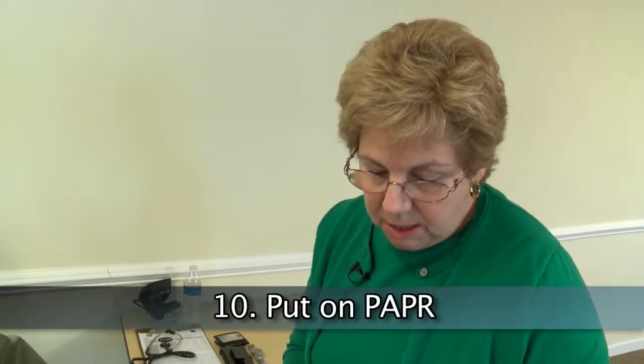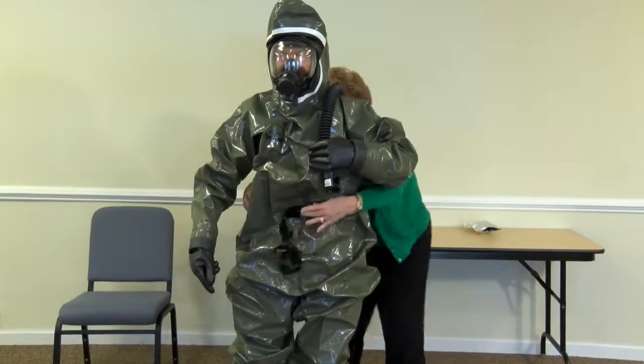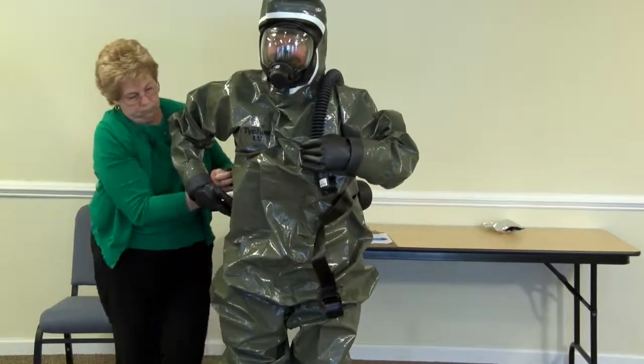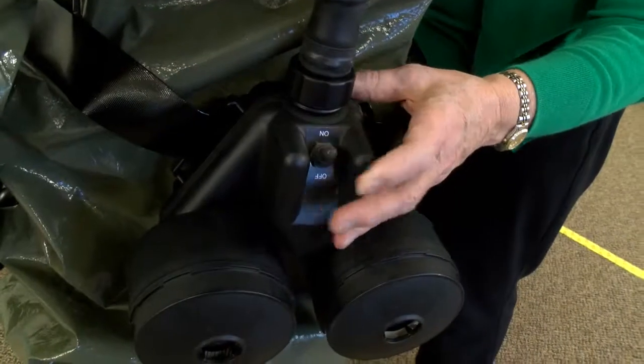Put on the PAPR. Clip the belt from the power unit around the waist on the outside of the suit in the small of the back. The PAPR should be assembled and tested prior to use. Connect the breathing tube to the face piece and turn on the PAPR.